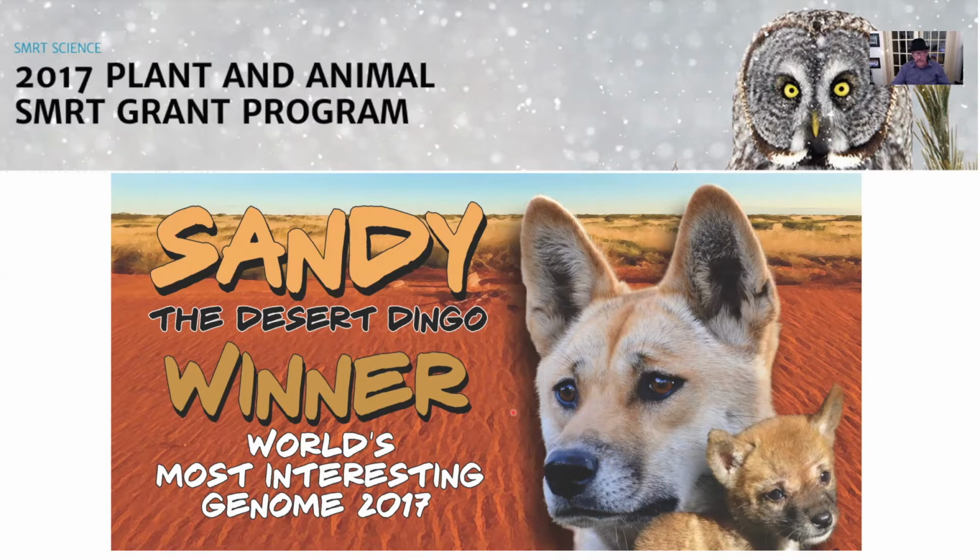The DNA was shipped to Dave Caderna's lab at Arizona, and he used 31 Sequel-2 cells to sequence the genome of Sandy to about 60x coverage.